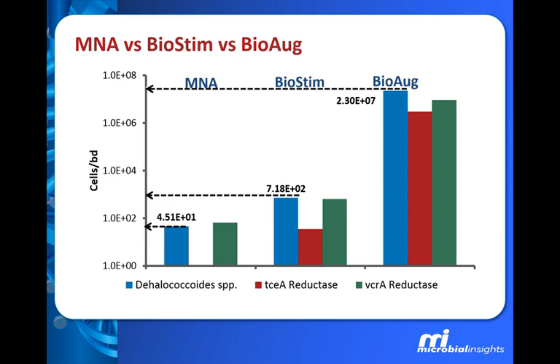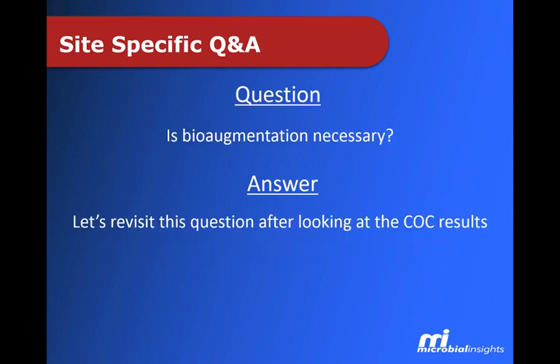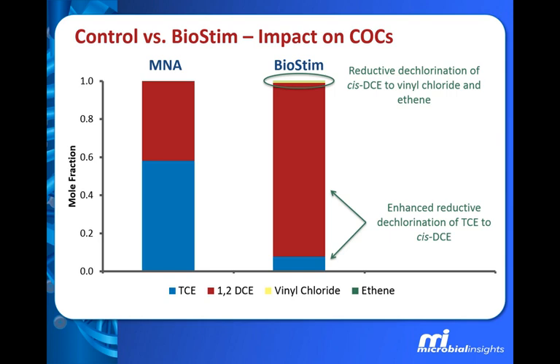And as well, we're seeing high concentrations of TCE reductase as well as vinyl chloride reductase. So again, the question, will the culture survive? Yes, it certainly did survive. Is bioaugmentation necessary? Well, let's revisit that question when we see the COC results.